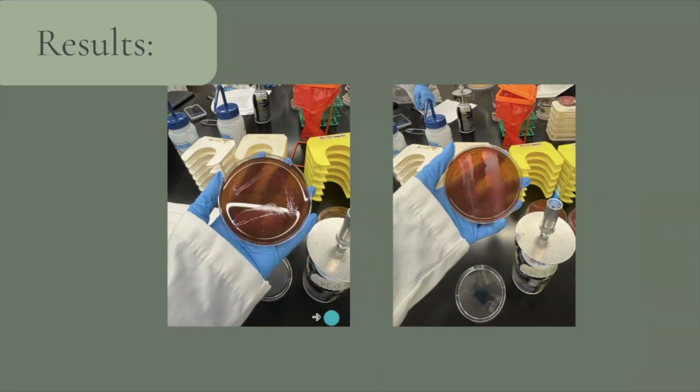For the E. coli, we can see that it grew better aerobically. Also for the S. faecalis. But they grow in all conditions. For the C. perfringens, we see no growth aerobically, so it's only anaerobic. And for our unknowns 114 and 294, they grow in all conditions.